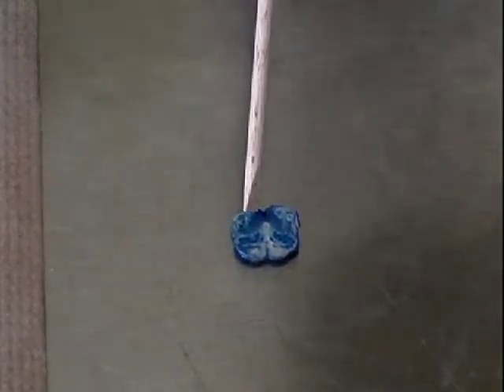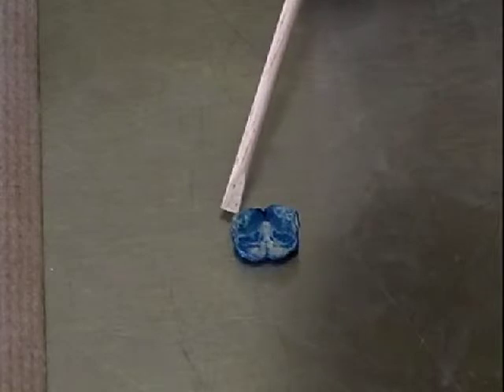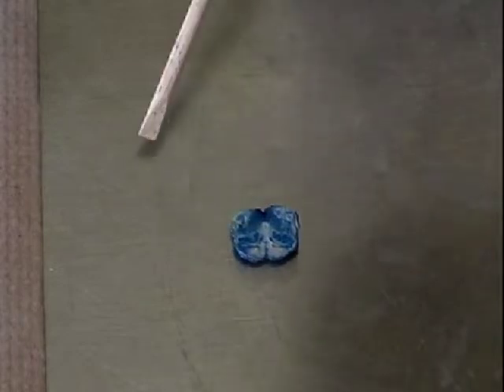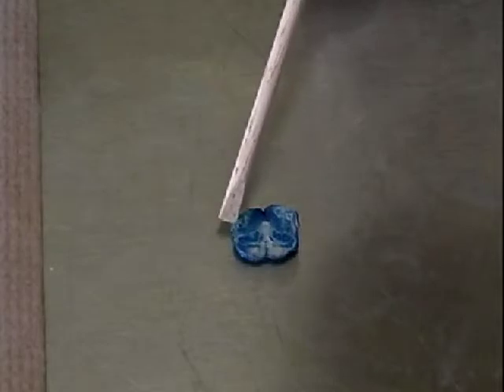And then up in this blue area up in here, kind of on the midline, meshed together, staining real dark blue, would be the hypoglossal and dorsal motor. Move out here laterally, you can see the accessory cuneate nucleus right there, some of the inferior cerebellar peduncle, that myelinated bundle around it. And then that little sharp blue area right there would be spinal nucleus 5 and the tract just lateral to it.